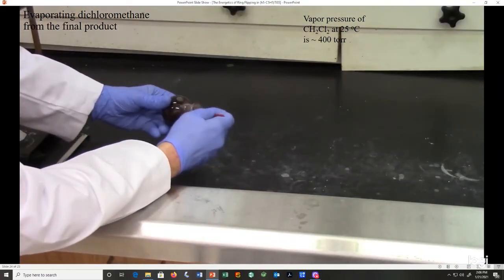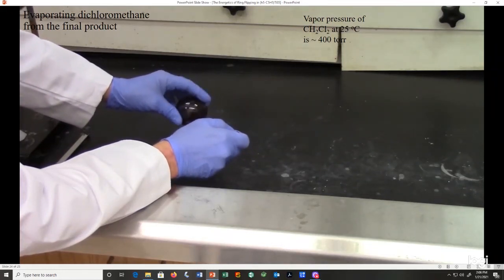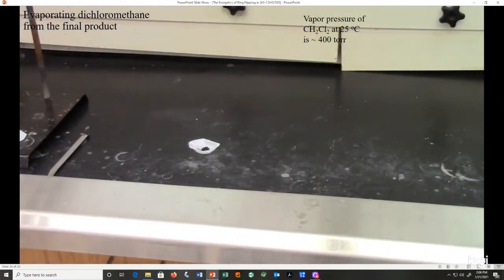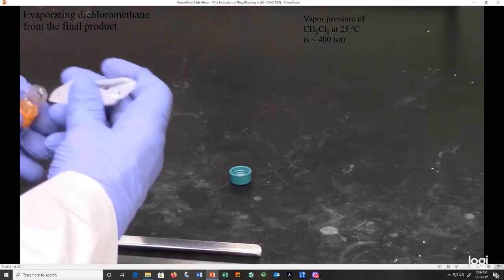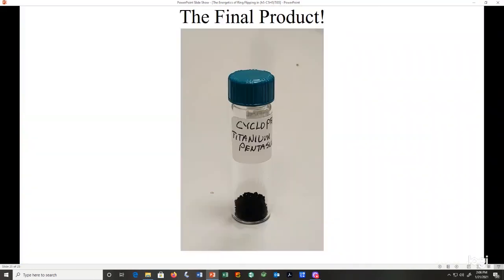So at this point, it's just a matter of scraping that product out of the round bottom flask and into a weighing boat perhaps. And then we're going to carefully put that into a vial. And we have our final product.